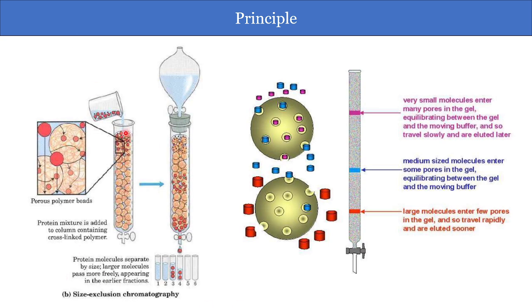So this is just a schematic where we can see the size exclusion chromatography. Here is a mixture of different molecules or proteins, and you have the beads over here. The small molecules are entering over here, whereas the big molecules just exclude the path. And you see there are different sizes. For bigger molecules you have this, for smaller molecules it enters, whereas the even bigger molecules do not enter and go over, passing the particular bead, right?